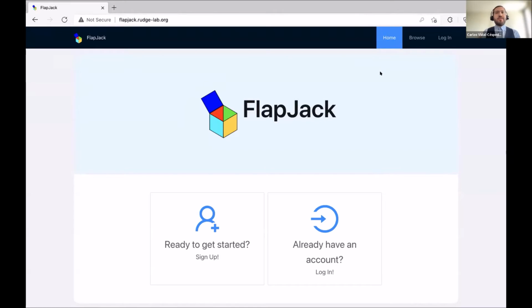So now let's review Flapjack's web interface. In this part of the tutorial, we will take a walkthrough of the main interface, learn how to format your data and then upload it to the platform, how to manage your studies, and finally, how to visualize the data in order to perform the analysis that seem relevant to you in a quick and easy way.